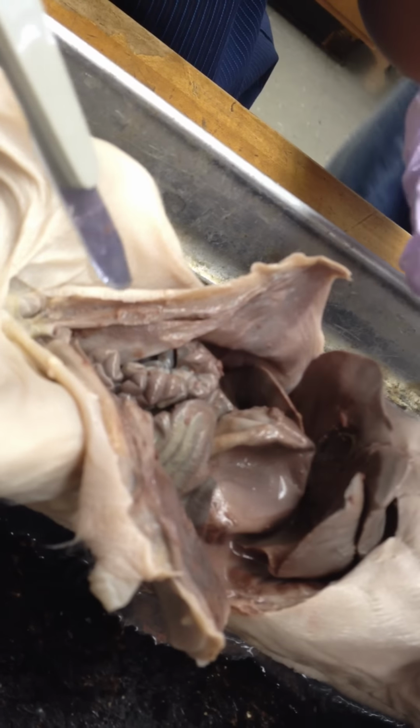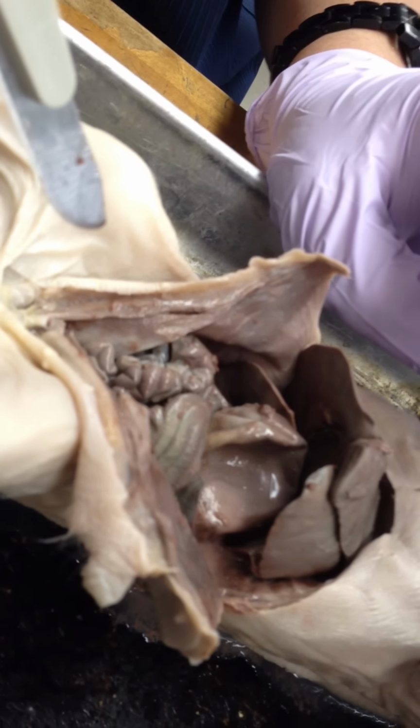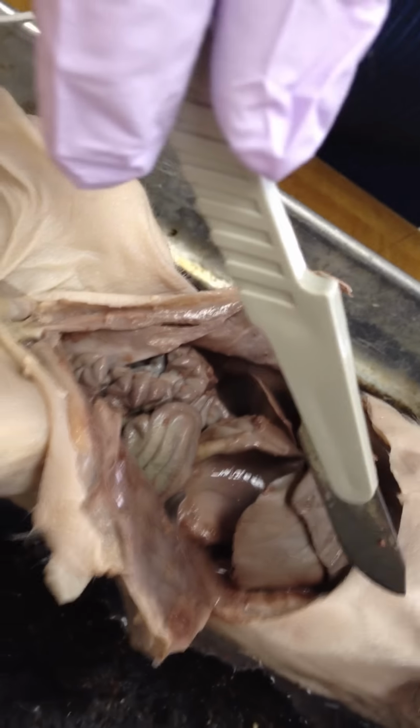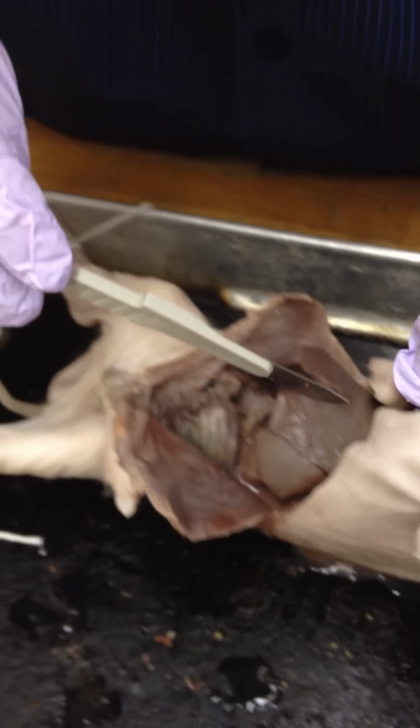God, this stinks. I told you. Yeah, you were making fun of me. No, I think I probably punctured something. I don't think I did the cut right. I probably cut it wrong. I think that's what happened.